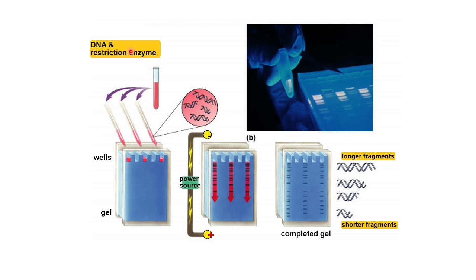Okay, so what happens here is you have DNA and you do some kind of restriction digestion. You digest your DNA using enzymes, endonucleases or exonucleases, and then you want to check it on a gel. You run the gel, the fragments run at different positions, and the longer fragments lag behind while the shorter fragments run faster.